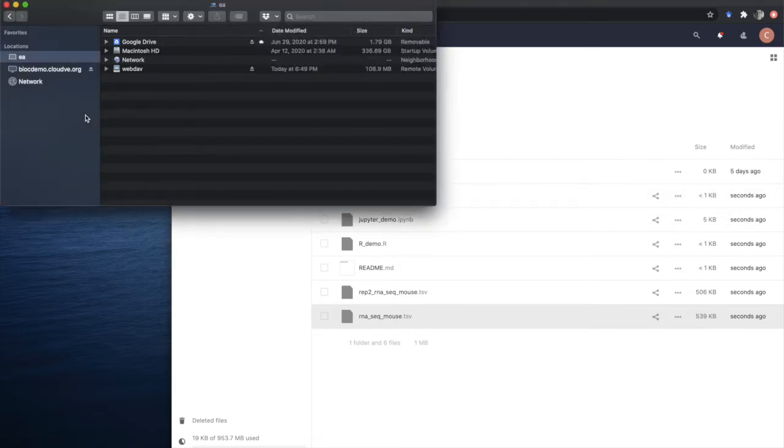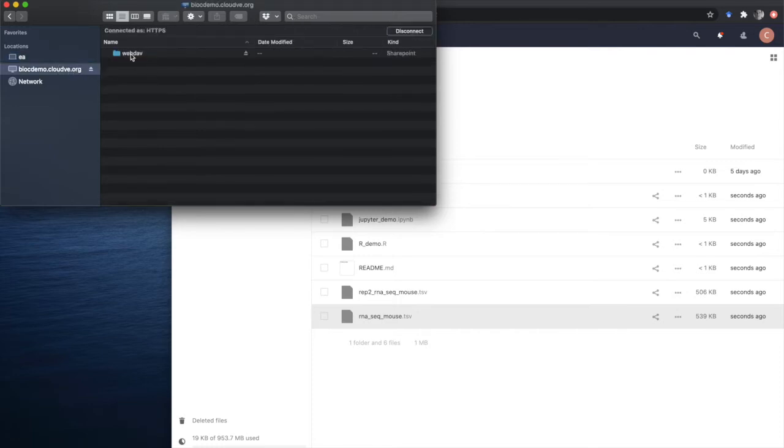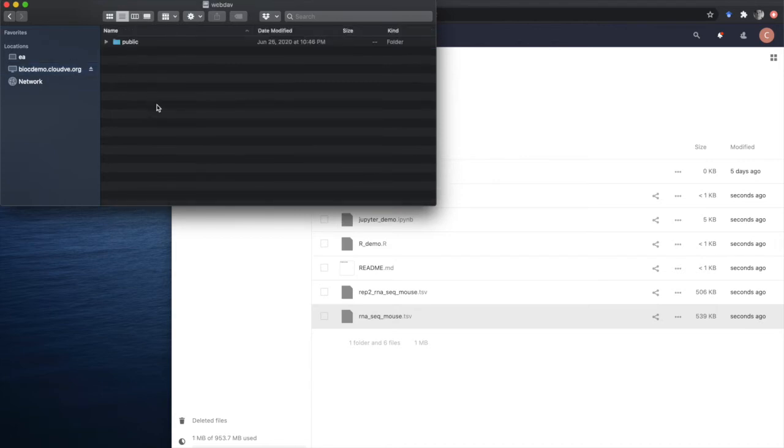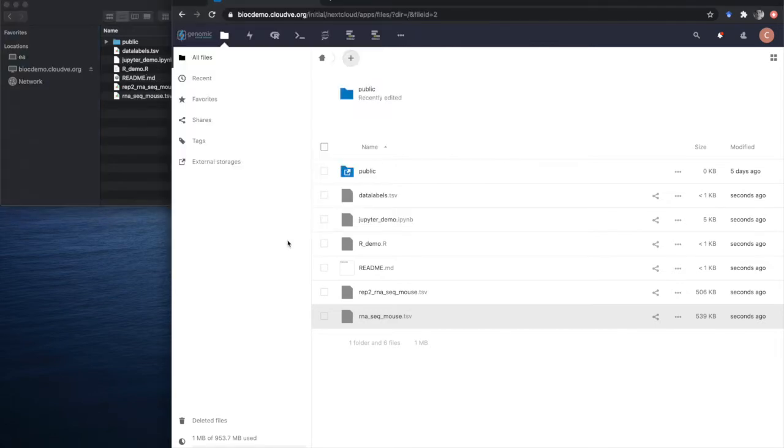In addition to the browser-based uploads, we can mount the GVL data storage, just like Google Drive, directly into a local Finder, in the case of Mac. In this case, the data that we uploaded through the web browser also appears on our local folder, and we can add more datasets like that.